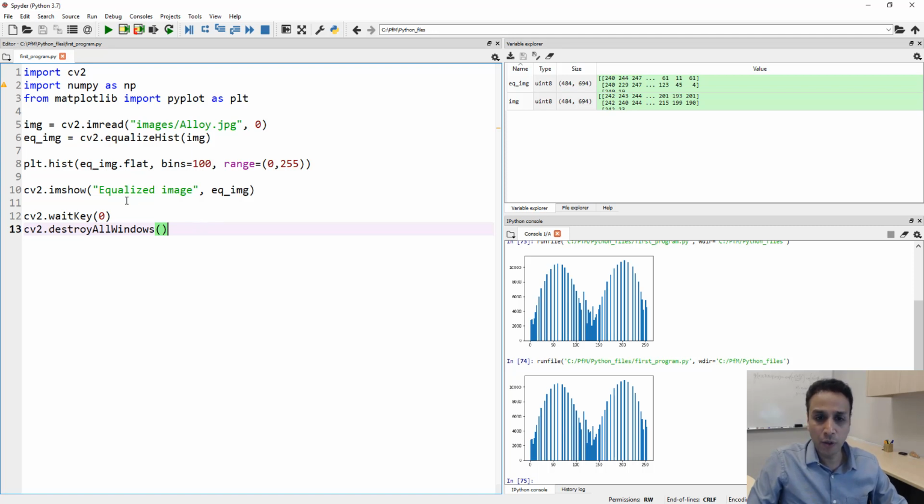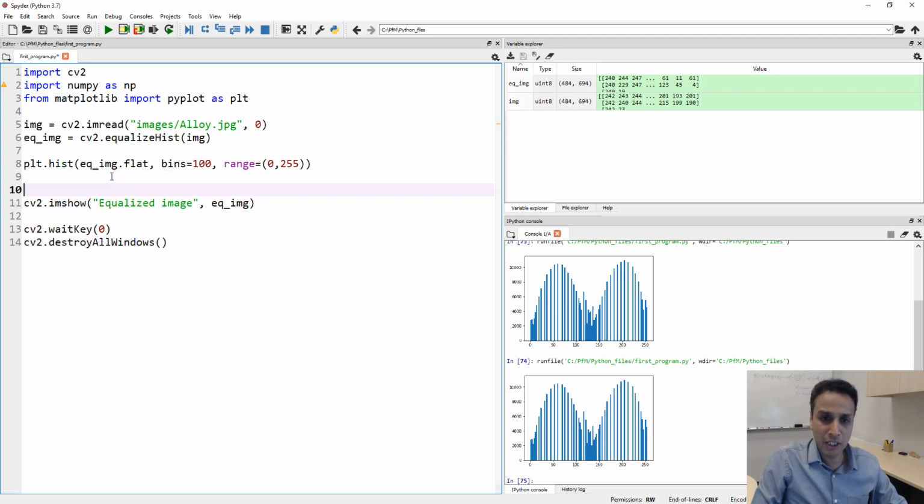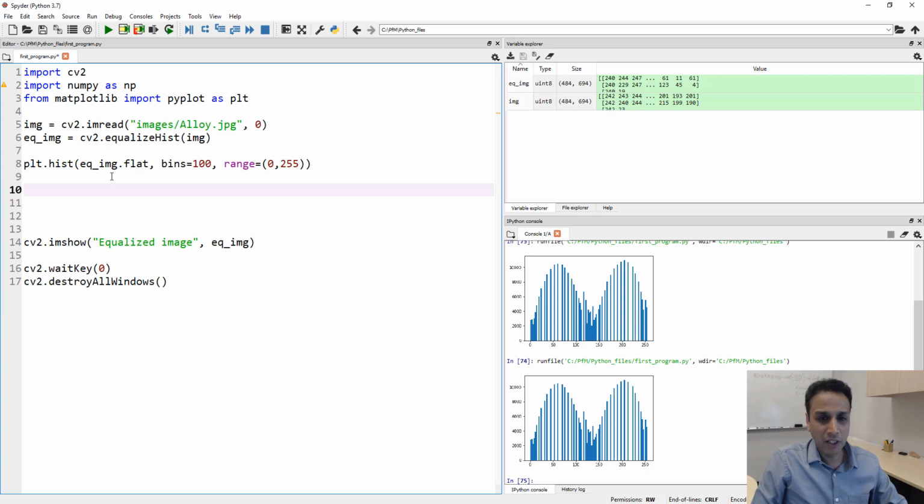So how do we perform that? Let's insert this one line right here. Well, actually this is two lines. Let's assign this to a variable called CLAHE. We need to create this first. I believe this is create CLAHE, and we need to give the limits, of what is the clipping size, for example. So in this case, let's just say clip.